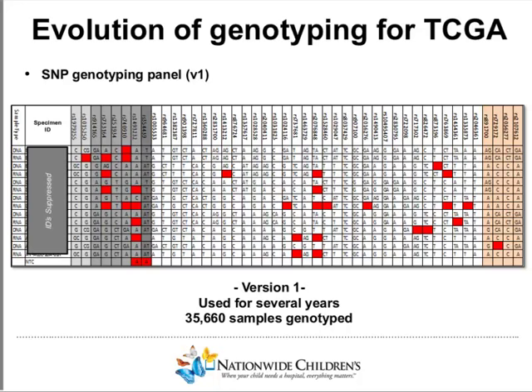And a couple things that I wanted to say about this slide was that we initially started using this for DNA, and we found that this panel did work very well for DNA. We had very few failed loci, and it gave us very good ability to resolve cases. But over the course of time, as identity investigations cropped up, we tried testing RNA on this platform, and we found that the RNA worked as well. And what we suspect is that we're able to detect the genomic DNA contamination of RNA within these samples and actually genotype off of that contaminating DNA within our RNA.